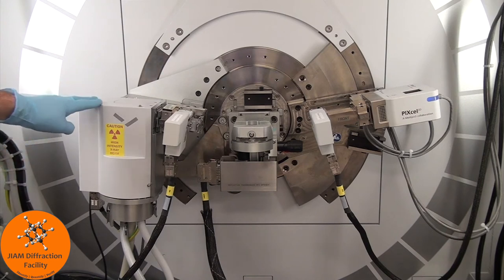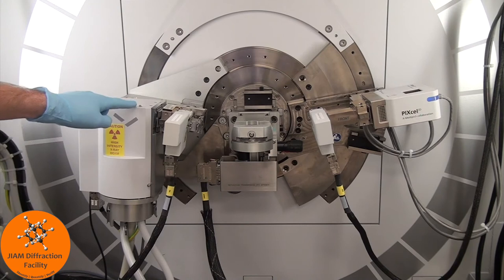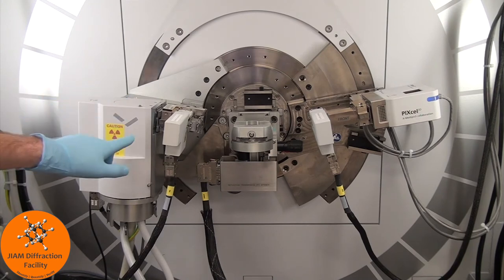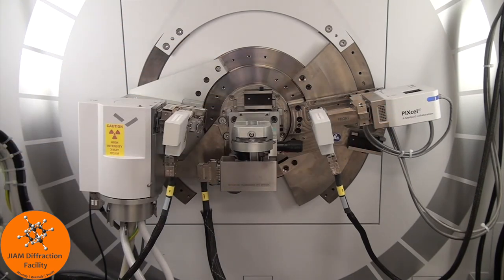Now this is where X-rays are generated, as indicated by the caution sticker. When this light is on, it means that the safety shutter is open and X-rays are traveling through the optics. In this situation, it would not be safe to have the outer doors open as they are now. The shutter won't open if the outer doors are open though. Now let's take a closer look at the optics on the incident beam side.